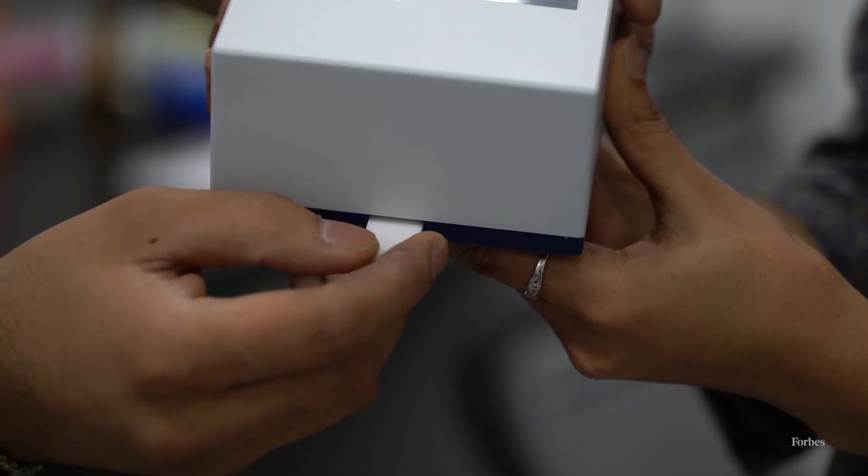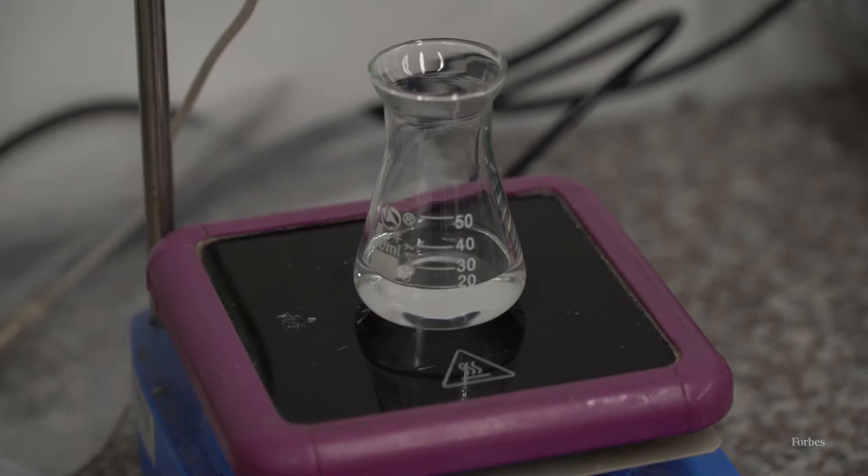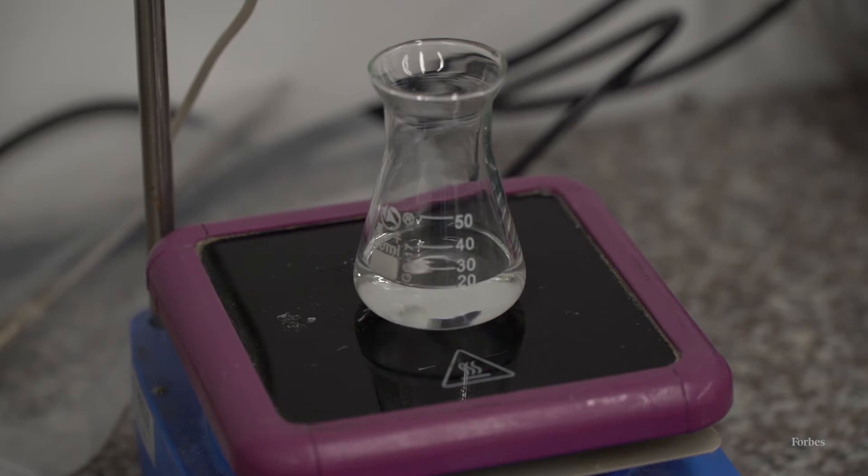How it works is you take a soil sample and you mix it with an extraction liquid, filter it out onto the chip, wait for a bit, pop it in the device, and push a button.